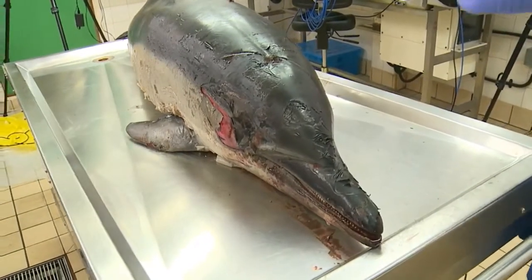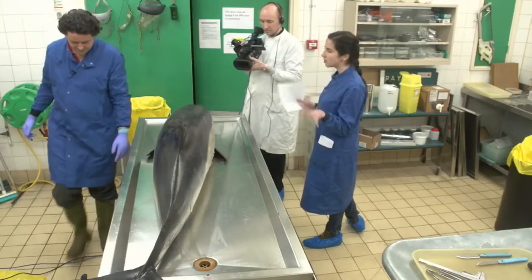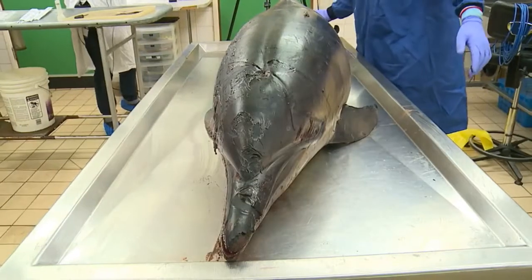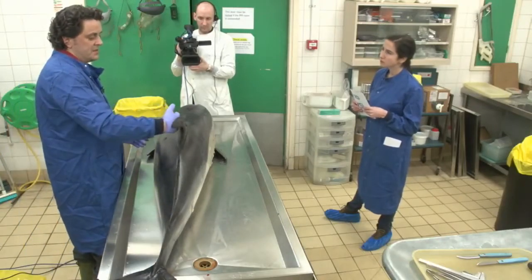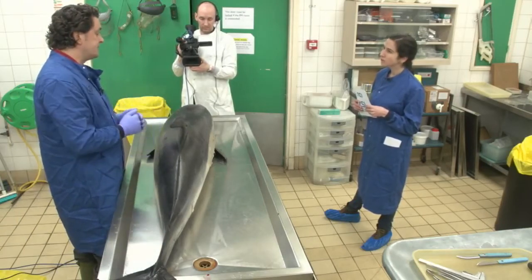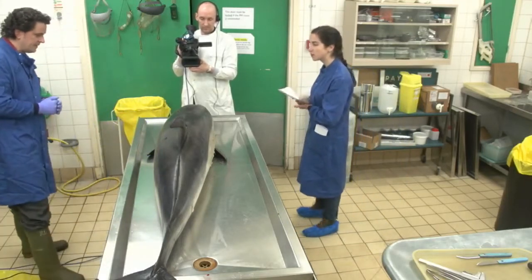So shall we go into that? Although one other question I wanted to ask you is, I know you also take a lot of measurements of the animal beforehand as well. Yeah, so we take a standard length measurement from the tip of the beak to the tail notch, and then an encircling girth measurement too. We've taken some measurements for a student in Ireland looking at dorsal fin morphology and a weight too. All that goes into our data set. Brilliant. Okay, well, go on to the other marks that you've been able to see as well.